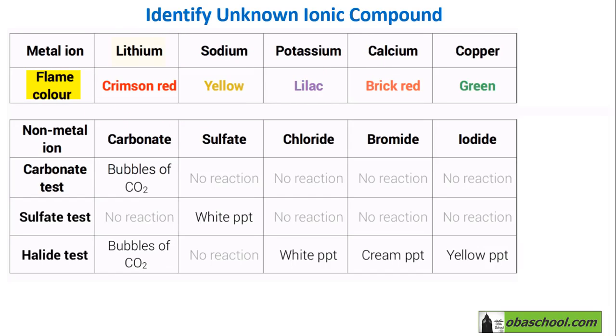And if you have a lithium ion, you should get a crimson red flame. If you have sodium, you will get a yellow flame. If you have potassium, you will get a lilac flame. If you have calcium, you will get brick red flame. And at the end, if you have copper, you will get a green flame.